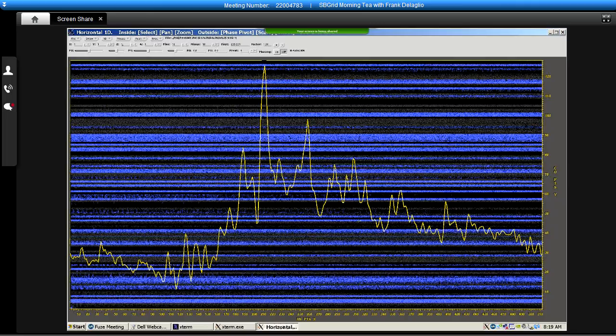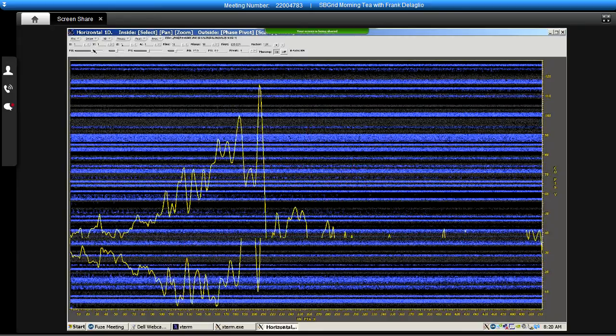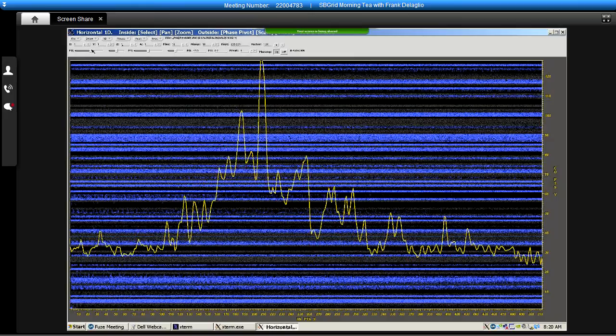We'd like to choose phase correction for this. We can do that in the command panel as well. There are buttons in the command panel that will turn interactive phasing on. So I'll click those with the mouse. And when interactive phasing is on, we can use these slider bars in the graphical interface to adjust the zero order or first order phase.